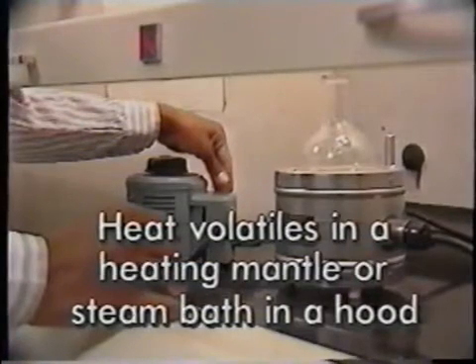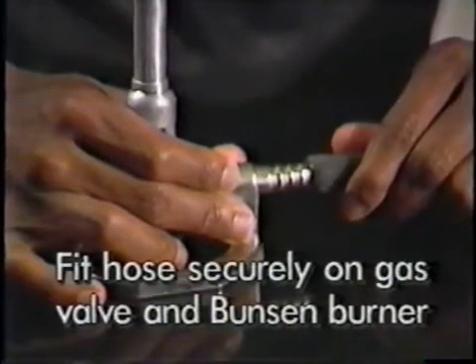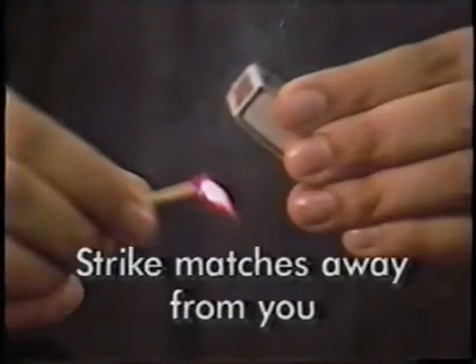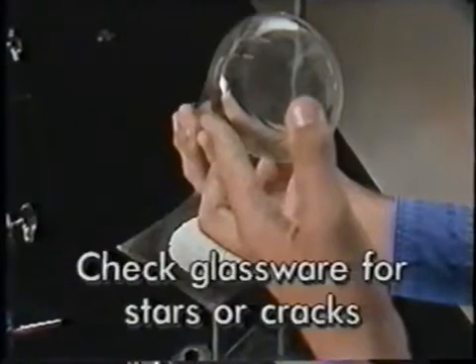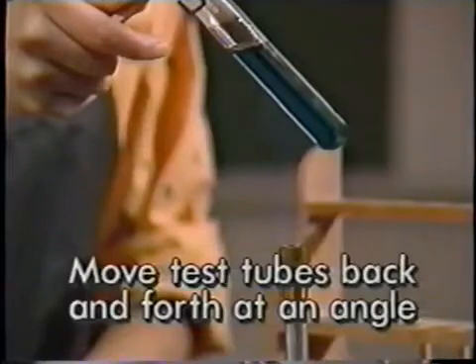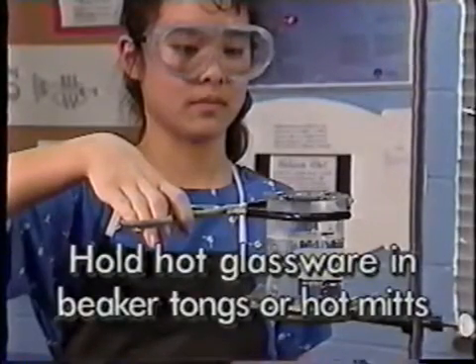To summarize Bunsen burner safety: heat volatile organics in a heating mantle or steam bath in a hood, not over a Bunsen burner. Check the gas hose for cracks and make sure it fits securely on the gas valve and burner fittings. Stand back from the burner while lighting it; strike matches away from you and turn on the gas after lighting the match. Turn the gas off immediately if the flame sputters, flares, goes out, or if you smell gas. Check glassware for stars or cracks. Clamp narrow-necked containers to the ring stand. Move test tubes back and forth through the flame at an angle while heating. Don't heat closed containers. Hold hot glassware with beaker tongs or hot mitts.